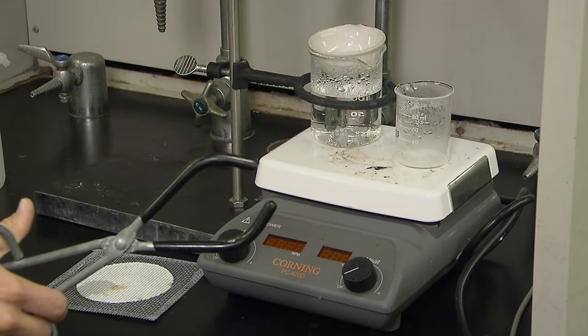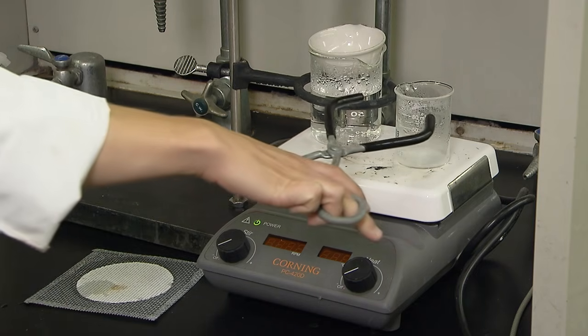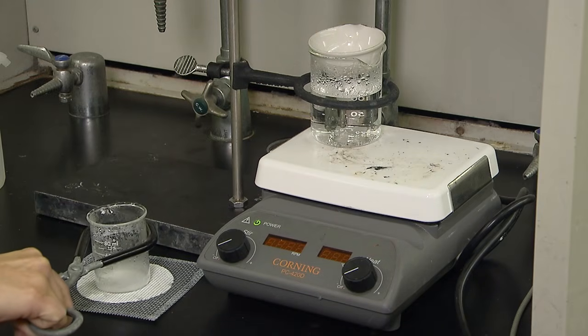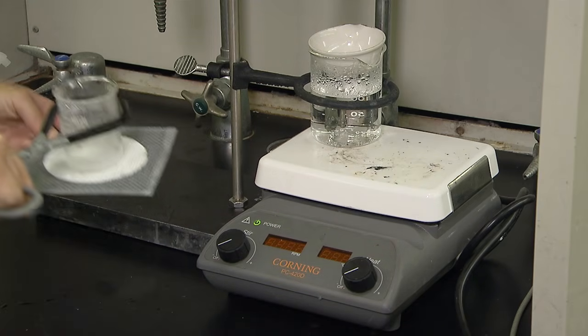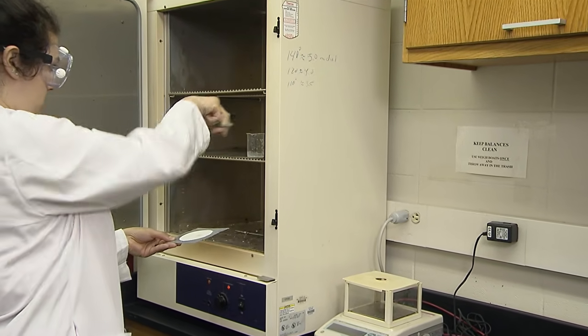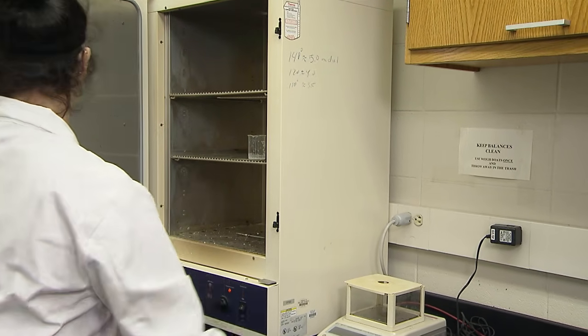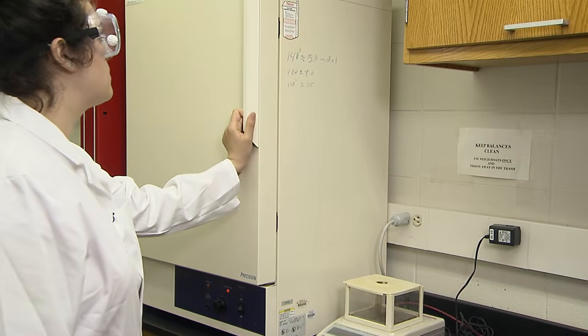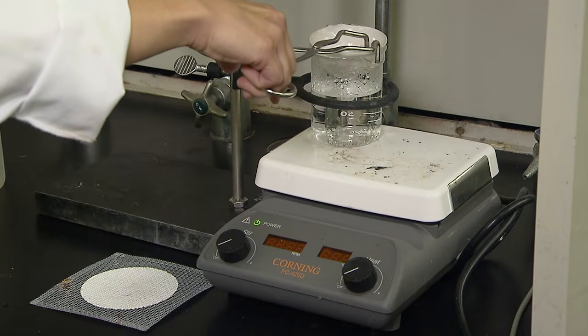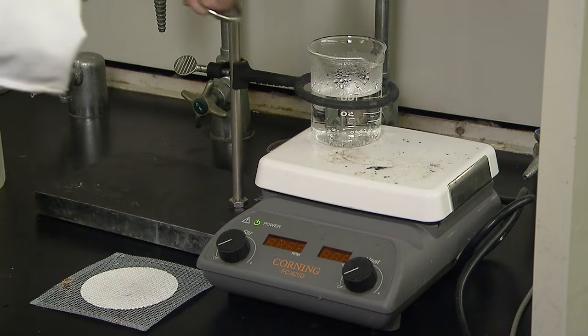As you continue with each step of the lab, check back on beaker 2 and the evaporating dish. When there is around 1 milliliter of liquid left in beaker 2, move it to the oven using beaker tongs. Always hold heat-resistant mat under hot glassware as you move through the lab. It will stay in the oven until completely dry. When the sand is dry in the evaporating dish, use crucible tongs to move to the heat-resistant mat to cool.